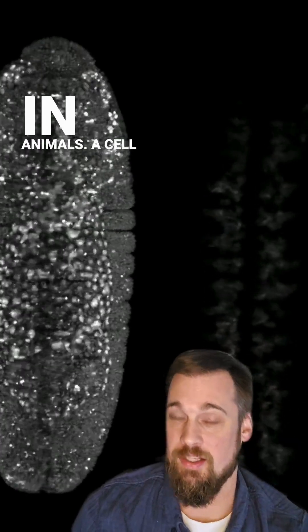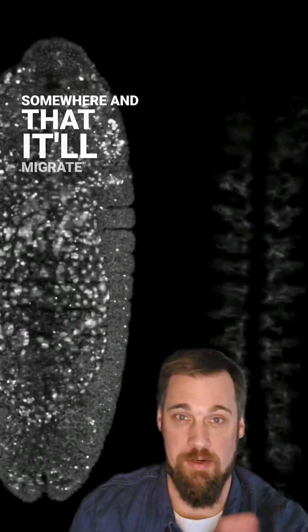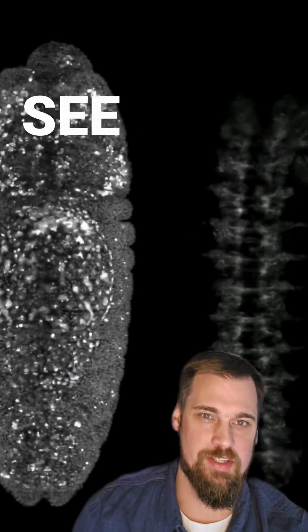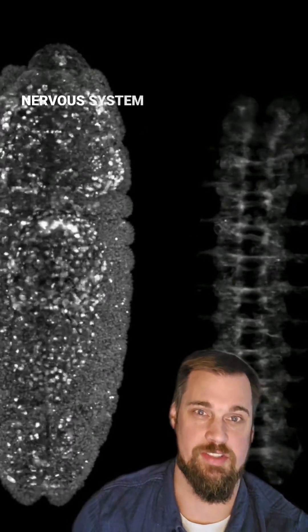And this is common in animals. A cell will be born somewhere and then it'll migrate during development. And another cool part about this video is right about now you can start to see the ghostly outline of the nervous system developing.